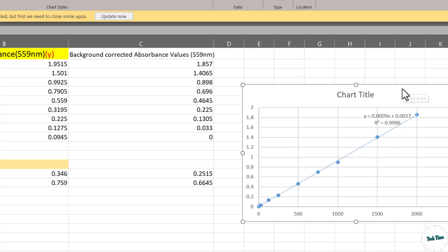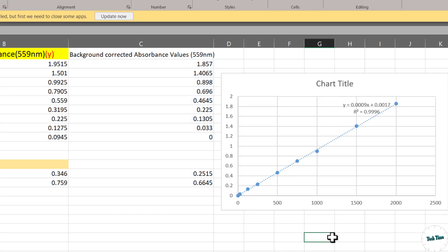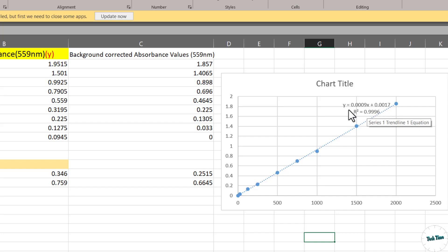Now you can see our chart gives us R squared value as well as the equation of the line y equals mx plus b which is depicted over here: 0.0009x plus 0.0017.